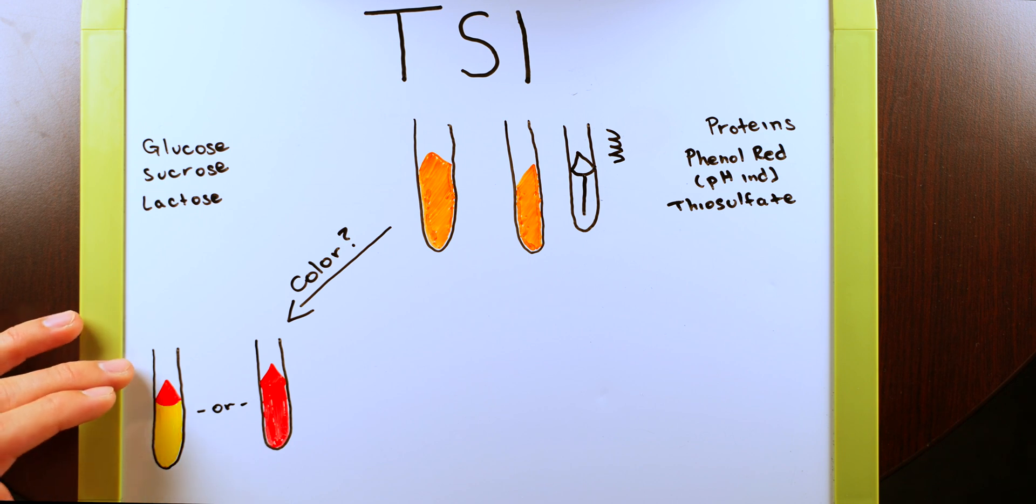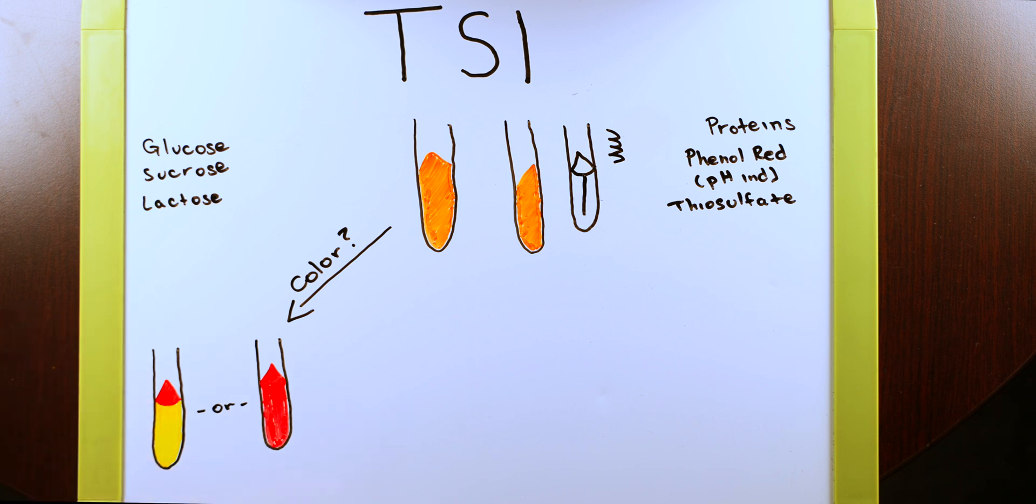Whereas the red indicates that we have alkaline end products, which is an end product of protein metabolism, which leads us right into our completely red test tube. This one tells us that we were able to use the proteins as an energy resource for the bacteria. But because there's no yellow here, this doesn't give us an indication that any of the sugars were used. A good question that you're going to want to have ready for your lab practical is how come we don't have a completely yellow test tube as a possible result for this. And feel free to answer that question down in the comment section below.